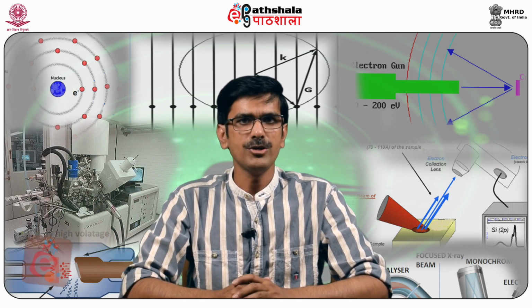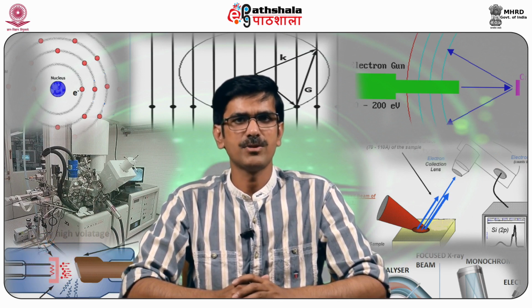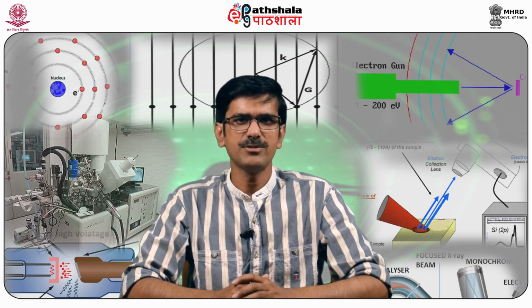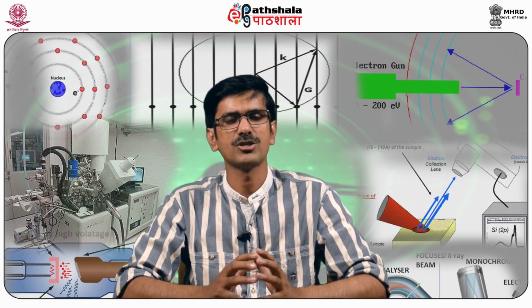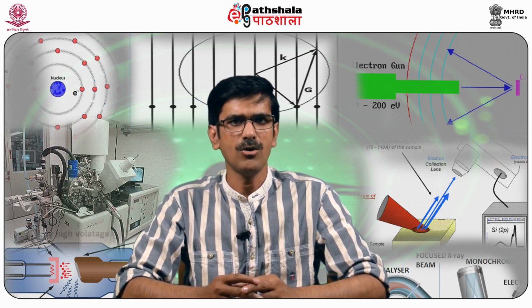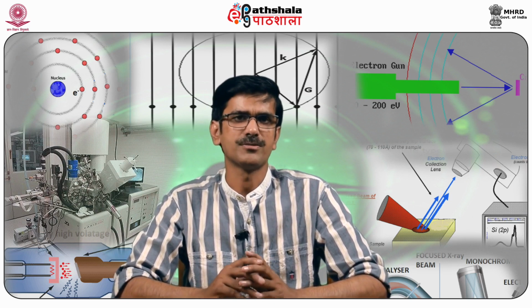Today, we are going to discuss the module Analysis of Energy Dispersive X-ray Spectroscopy under the paper of Surface Analytical Techniques 2. As the name suggests, analysis means detailed examination of elements or structures of a material. Similarly, in this module, we will study how to interpret the data obtained from an EDS spectrometer.